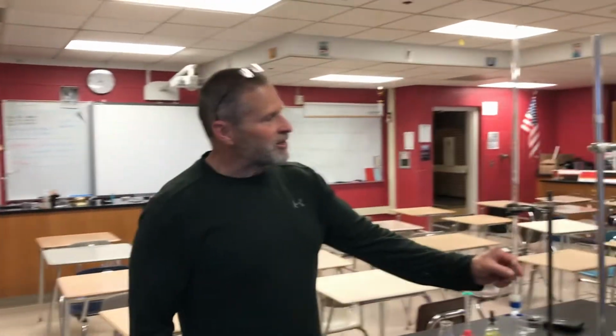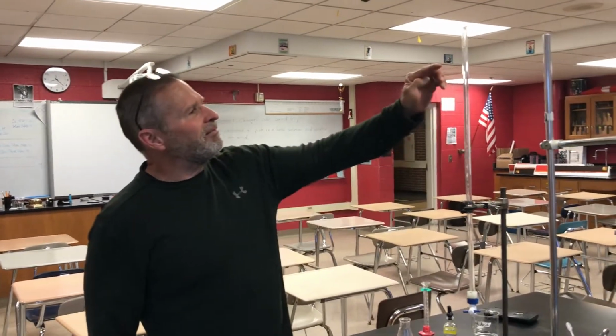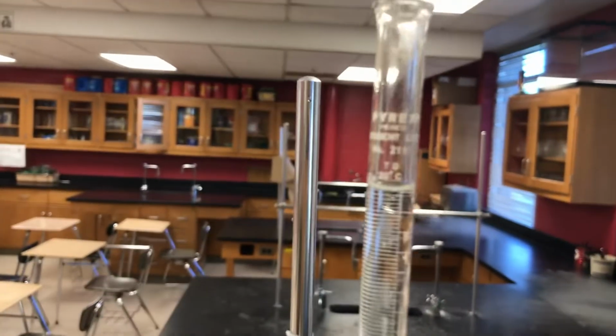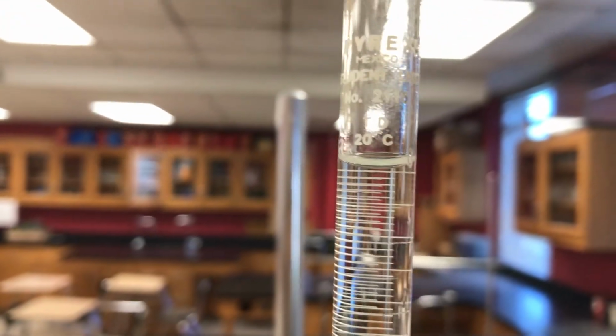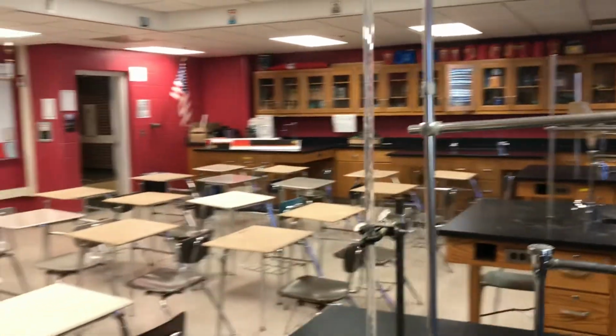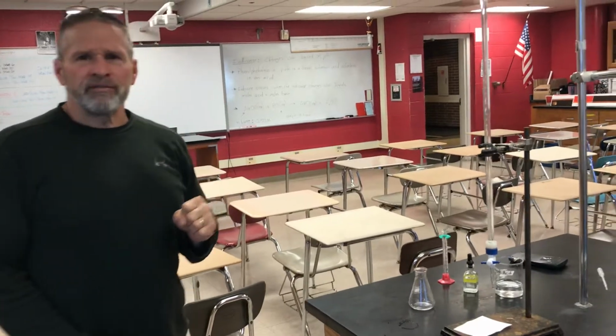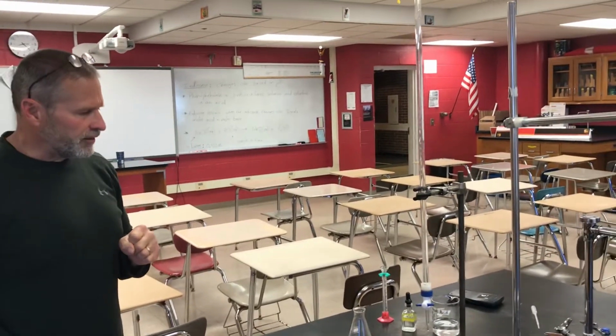Okay, here's what we've got. We've got some NaOH in our burette, loaded up to the 0 mark, right there at the top. What did we say the concentration was for this base, Mr. Moore? 0.15. Molarity, yep. Sodium hydroxide, 0.15 molar.